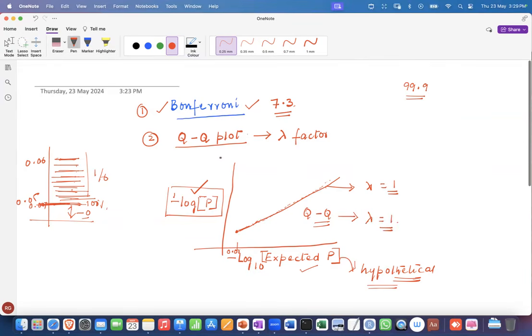Once again, okay guys, what are we talking about? Once you finish your analysis, the most important thing is how to interpret your data. To interpret your data, only consider SNPs that are beyond your Bonferroni cutoff. That's the first one. And the second thing any reviewer would ask you for your GWAS analysis is the QQ plot, and this QQ plot covers all the values.